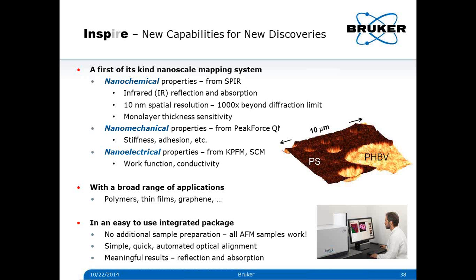You don't have a high power OPA amplifier system that would burn your sample, and you are not using a technique where you rely on photo-excited expansion. You don't need that here, so you don't need high powers. This is only small power in order to probe the sample properties, of the order of a few milliwatts at most. But we haven't seen any sample damage so far in any of these measurements.